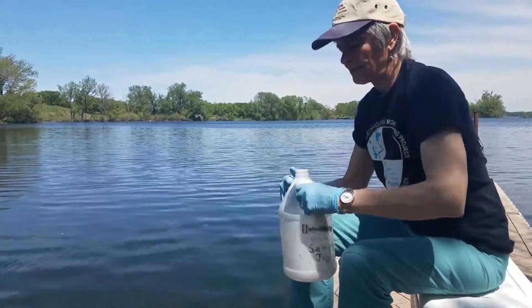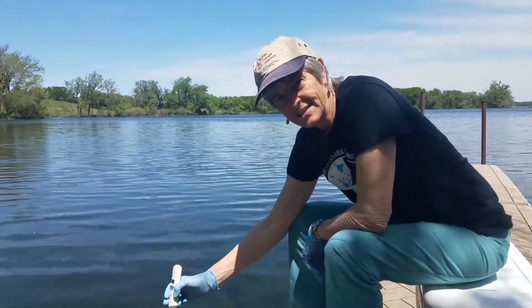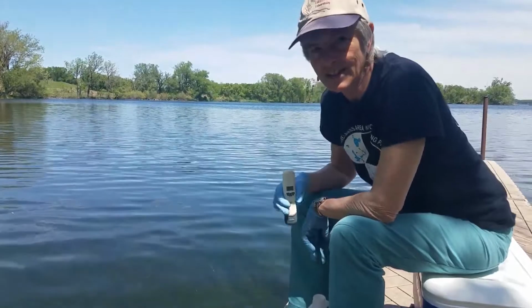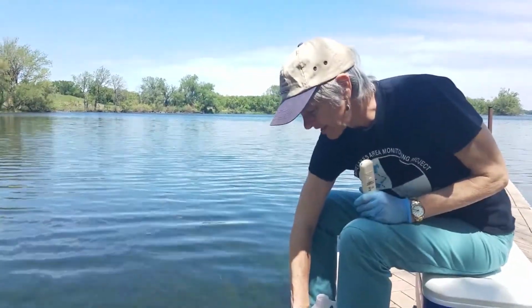Because this pen does not have a cable on it, we don't want you leaning into the lake to take the measurement, because you might drop the pen or you might fall in. So instead, you want to bring the lake to you. When you get to your particular location, get the right sample bottles ready.